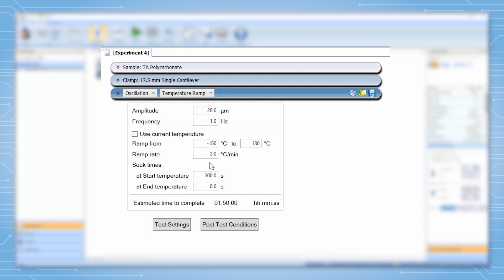We can also set a soak time for the start temperature. If we are not starting at ambient, we should add an approximate five-minute soak time.